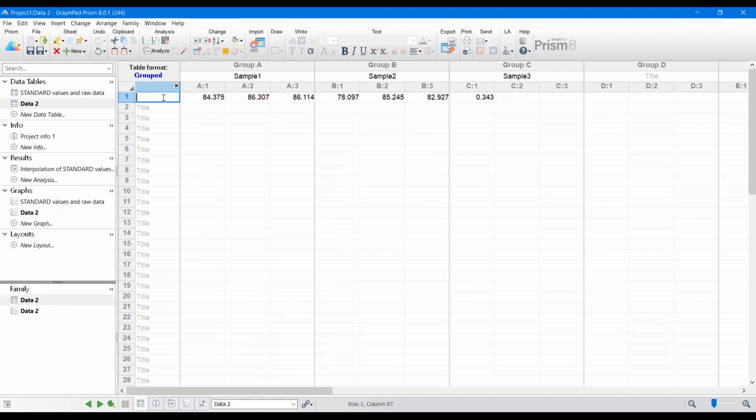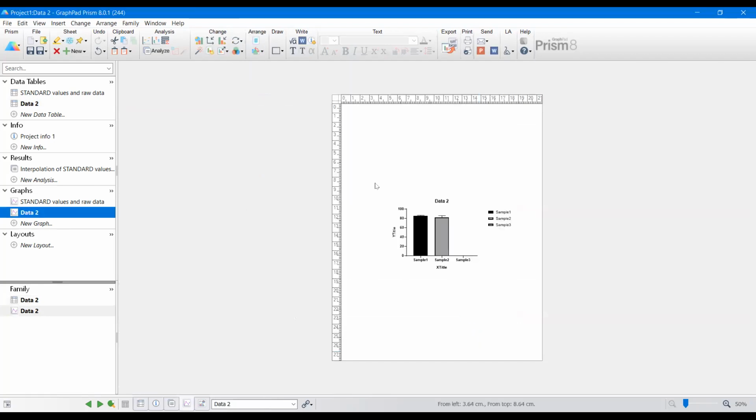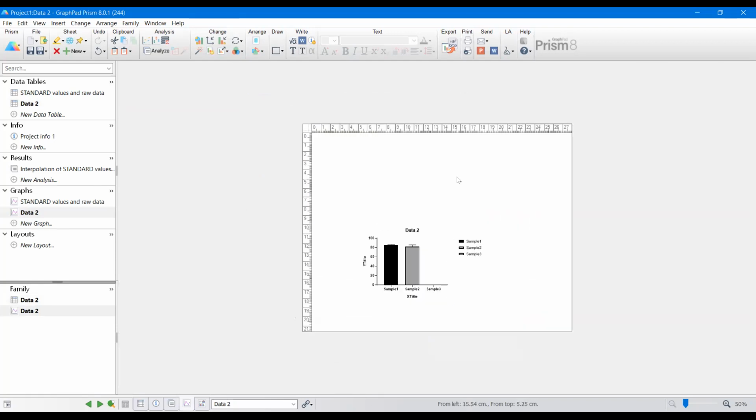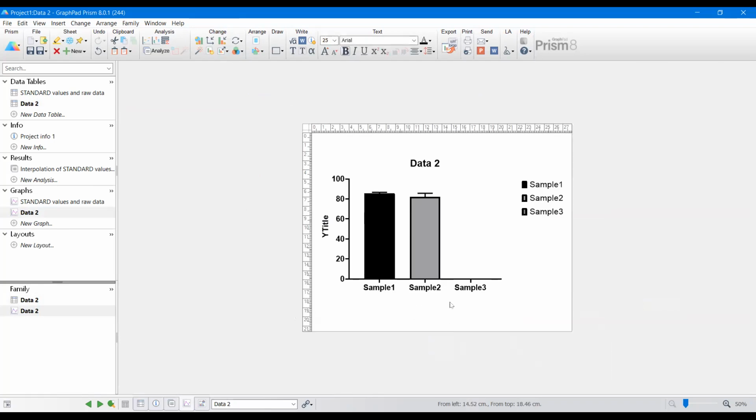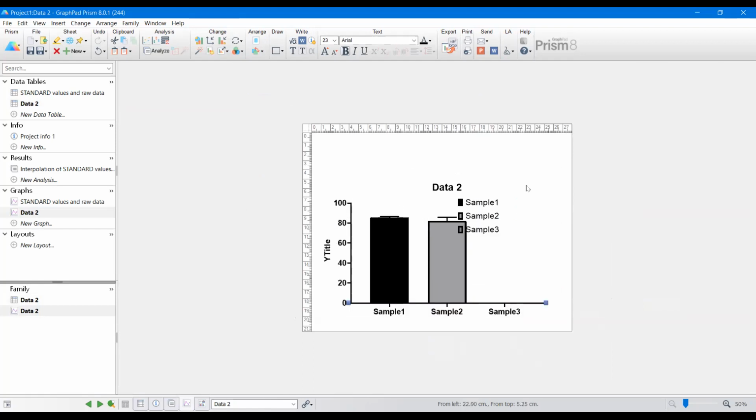And let's say, what was that? Insulin level. And now I have the graph, which was made by the program. I think it's pretty easy to work with this one. Then you can change to landscape, resize the graph to fill the page, and then remove these ones. And also you can make some adjustments to the axis and the graph appearance.